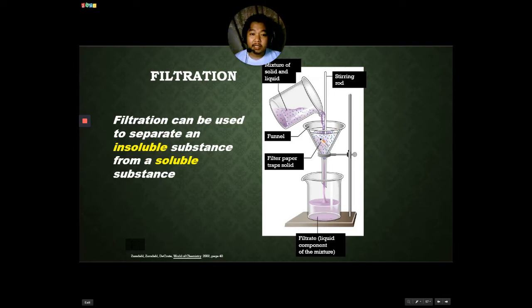So, we actually have a process for creating this circular form. Hopefully, we can do the laboratory so that I can teach you how to do it. You pour it so that the insoluble substance will settle here. Now, the liquid that passes through here is what we call the filtrate, or the product that has been filtered, while the insoluble substance that remains in your filter paper is what we call the residue.